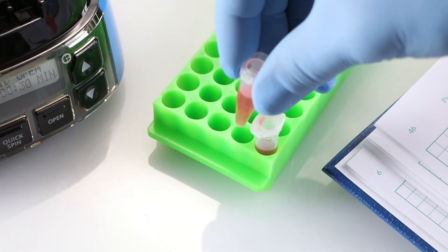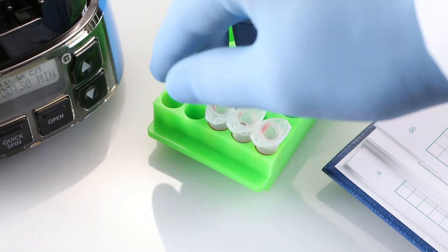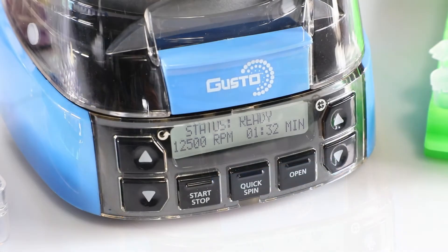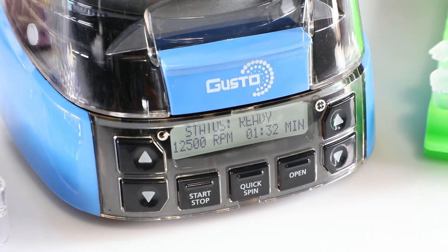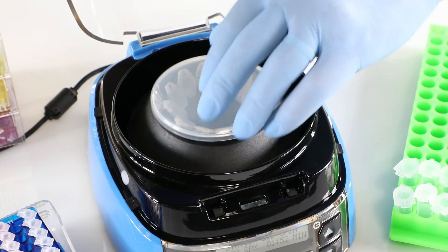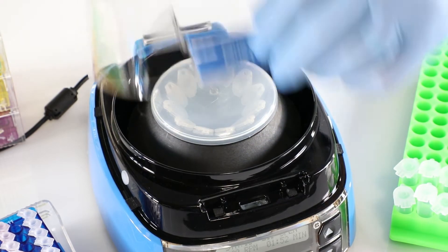An ideal solution for PCR, microfilter cell separation, and HPLC protocols, this mini centrifuge performs fast spins up to 12,500 RPM and 9,800 RCF. You'll find the Gusto high-speed mini centrifuge is as functional as it is fast.